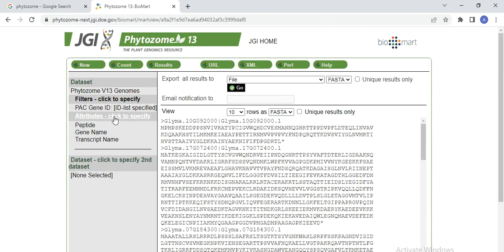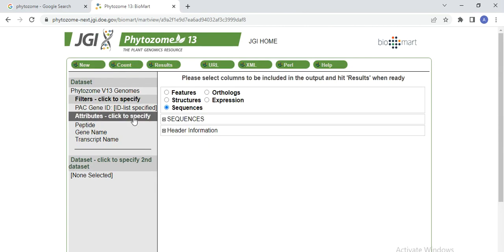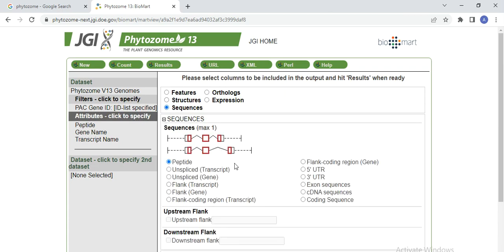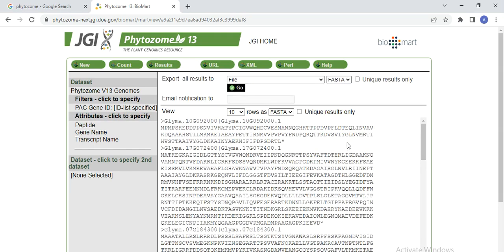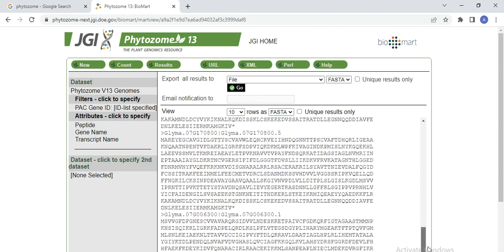Now click on Attributes and click to specify. When you click here, first you need to click Sequences. What type of sequence do you need? First, you may need peptide sequence or protein sequence — so select Protein sequence (or peptide sequence) and click on Result. Here you will see the peptide sequence of all your genes.